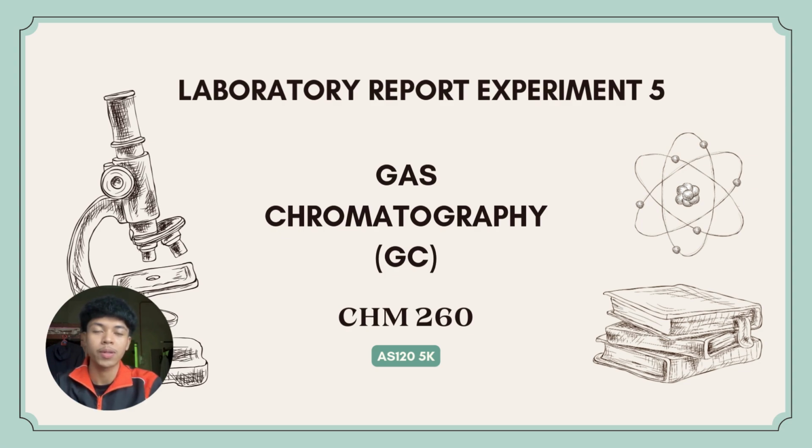We'll be presenting the lab report for experiment 5, which is gas chromatography.